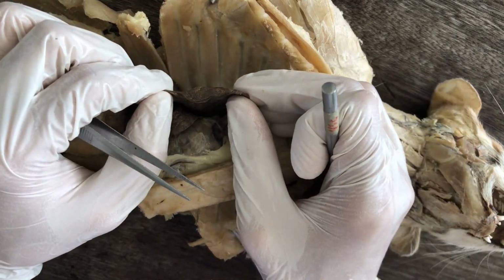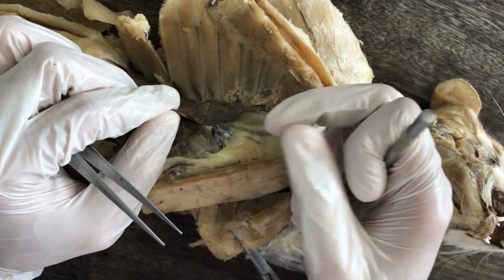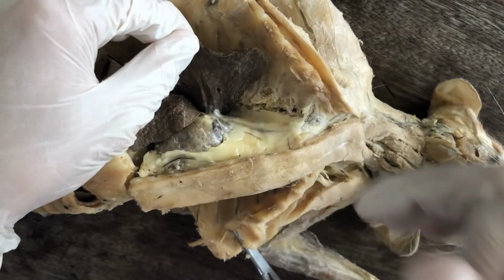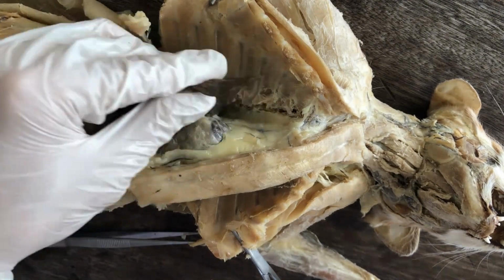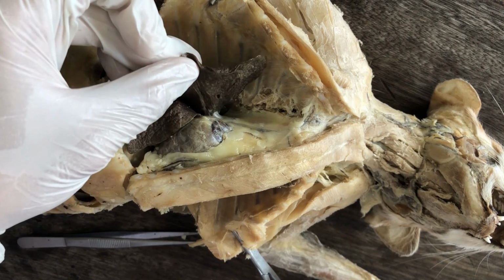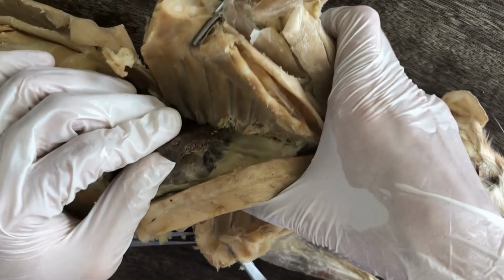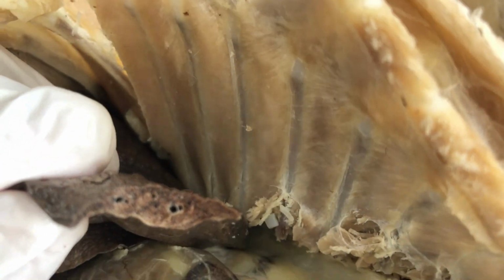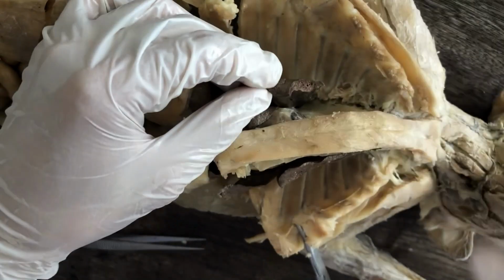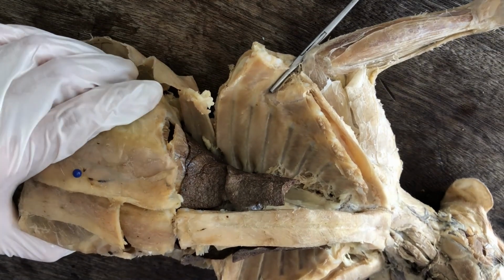And then eventually each bronchiole will terminate into a thin-walled and moist sac called alveolus, plural alveoli, where the gas exchange actually occurs. So let me see if I can show you. Let's cut a piece of the anterior lobe of the right lung. If you look closely, there are holes, right? Those are the finer branches that I'm talking about, the bronchioles, which will later terminate into an alveolus, okay?